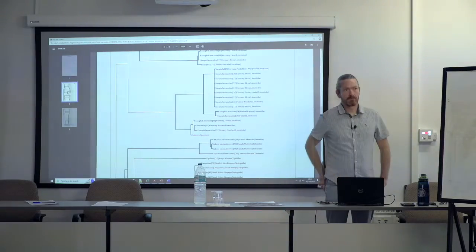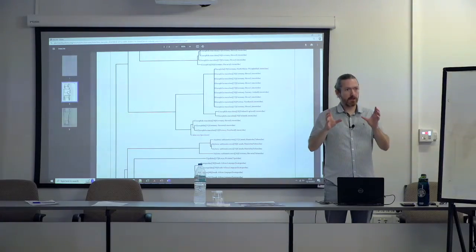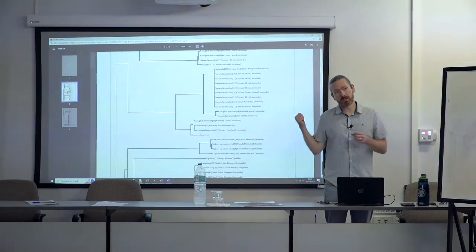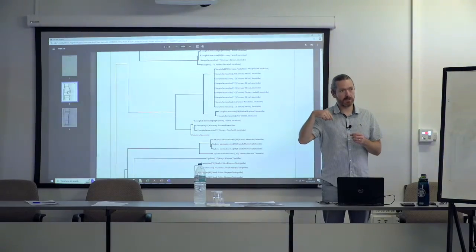Yes. Who put the data up? And yeah. So yes, there is a way. If the data is published, publicly available, then you can go and see that record and who identified it and who sequenced it and where the voucher is and all those sorts of things. If it's private, no. And one good thing about Bold Digger, which is the one I'll go on to next, is it can download that public data for you into the spreadsheet.